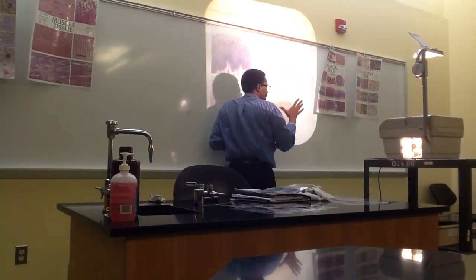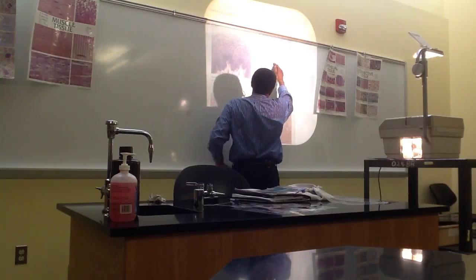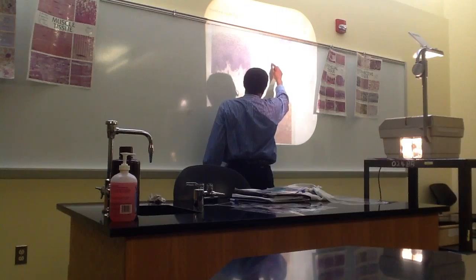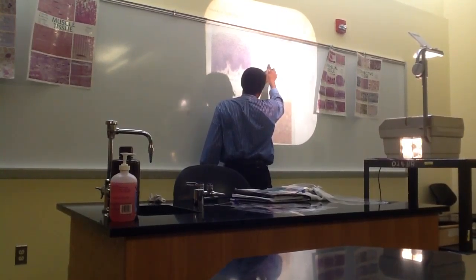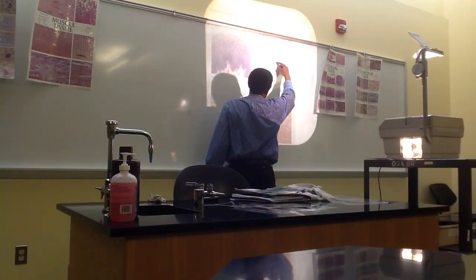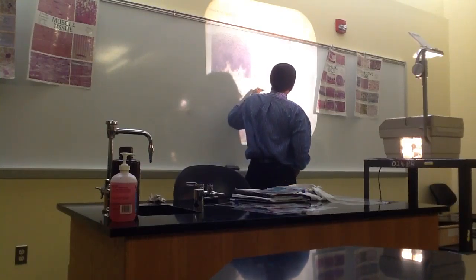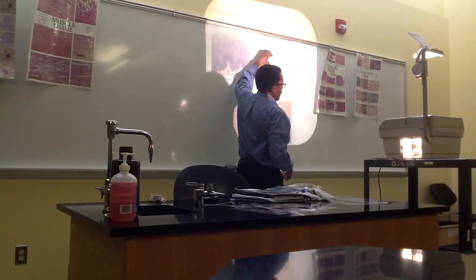We're dissecting this. We're tearing it apart to analyze it. So what is this in the middle here? A free space. Okay? What is this line of demarcation between these cells that stain one way, look one way, versus these cells? That's the basement membrane. Okay? And this is a circular structure. It's a duct from a sweat gland.